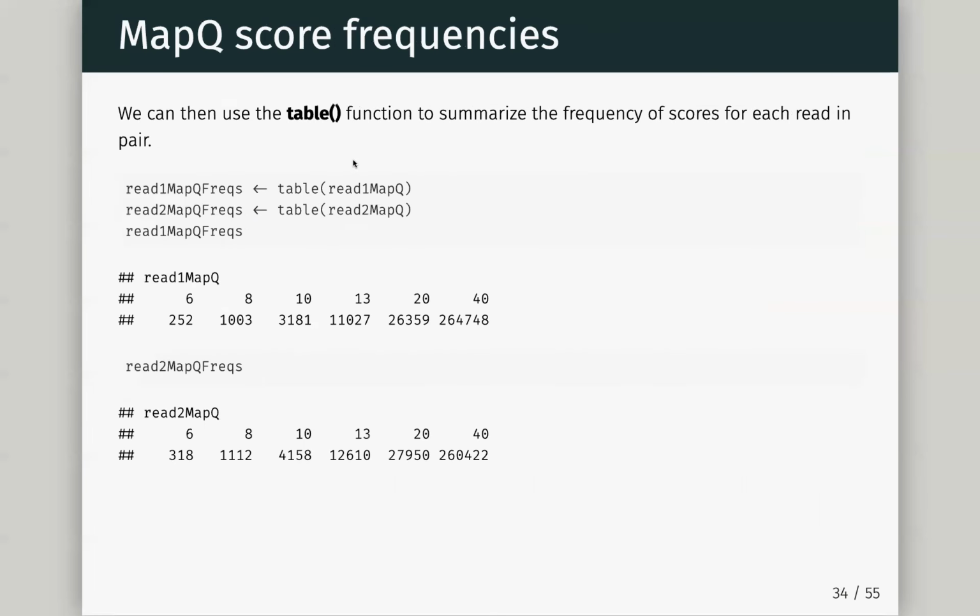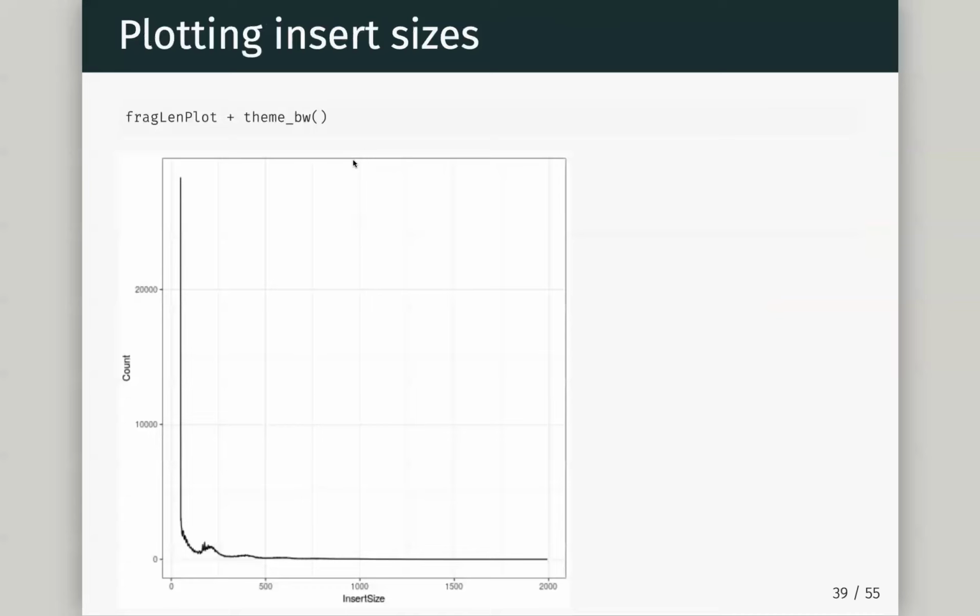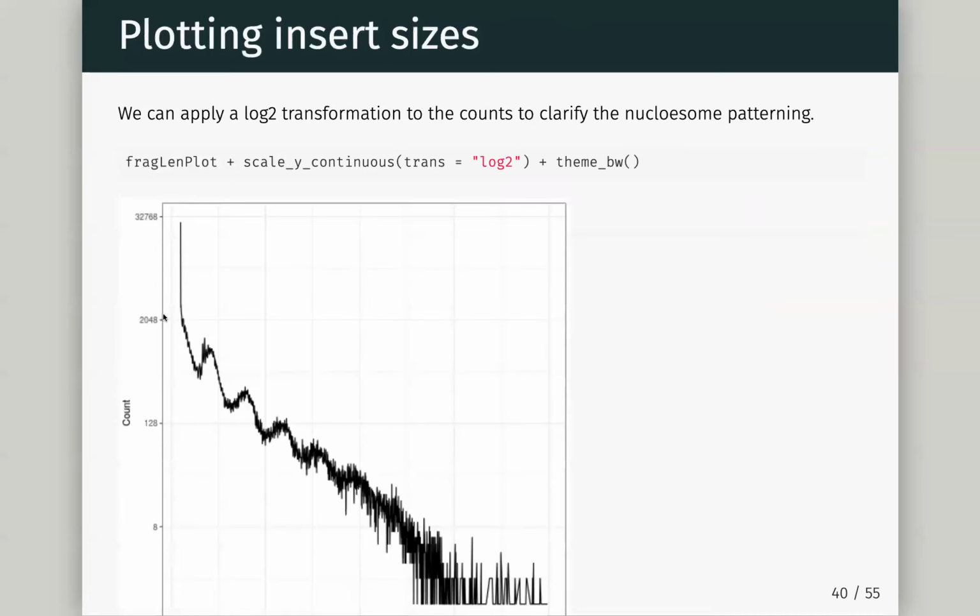When I first did this course in this class, there were a lot of people going, oh, my data doesn't look like that. And it's because in reality, if you use too high a concentration of transposase, leave it too long, you get rid of all these other fragments. You end up really with just these short. You manage to break up all your DNA.